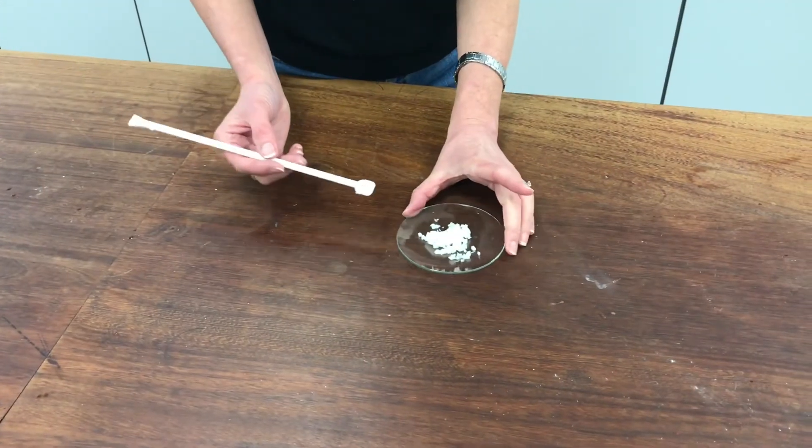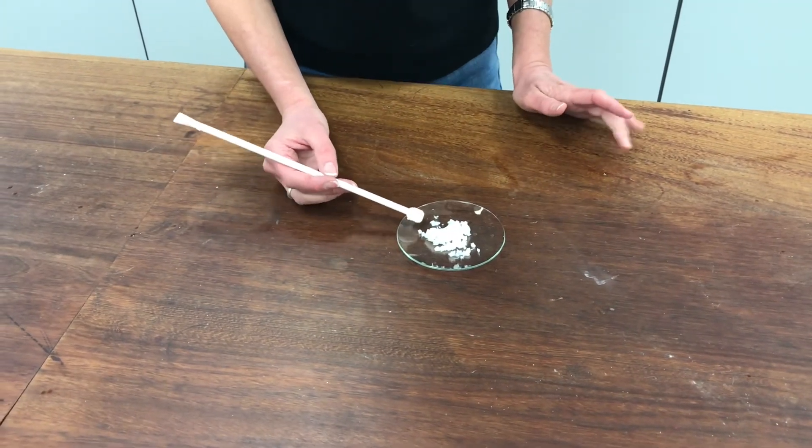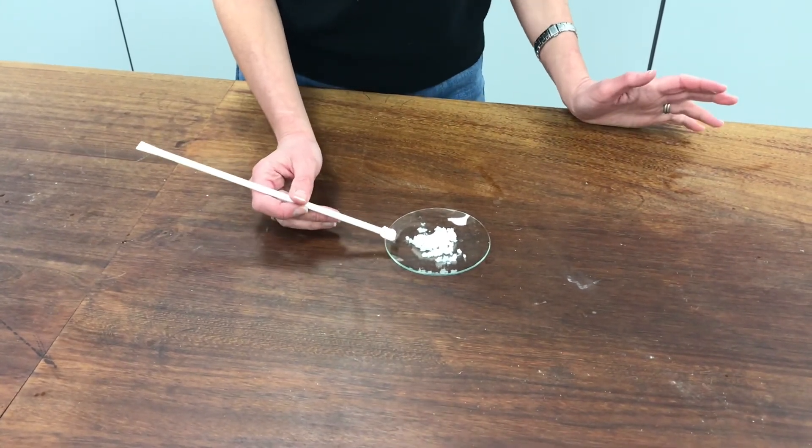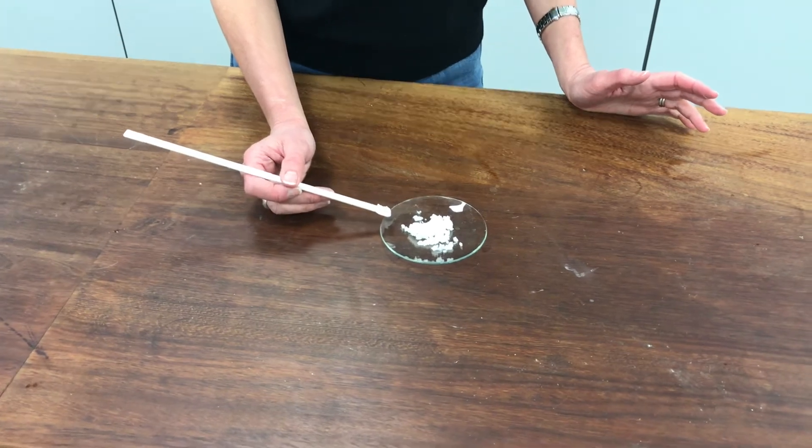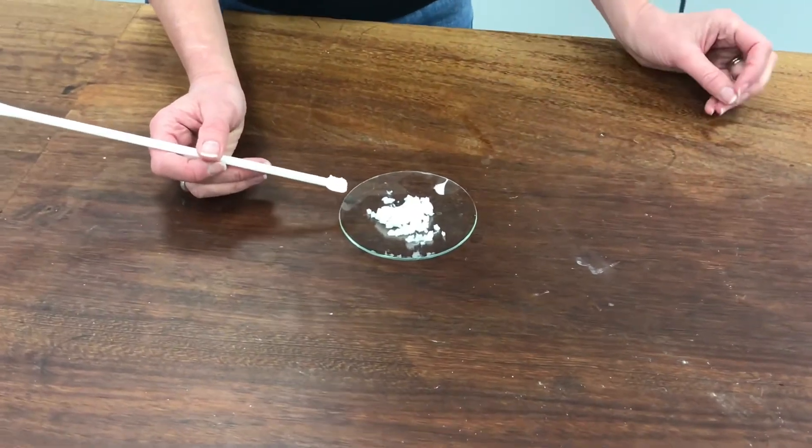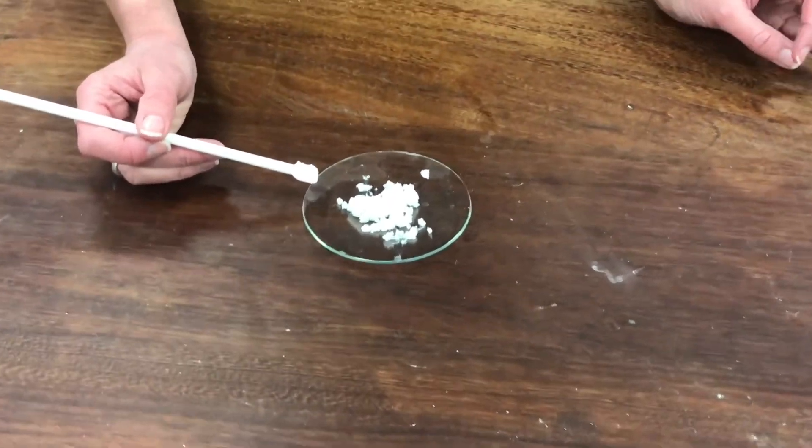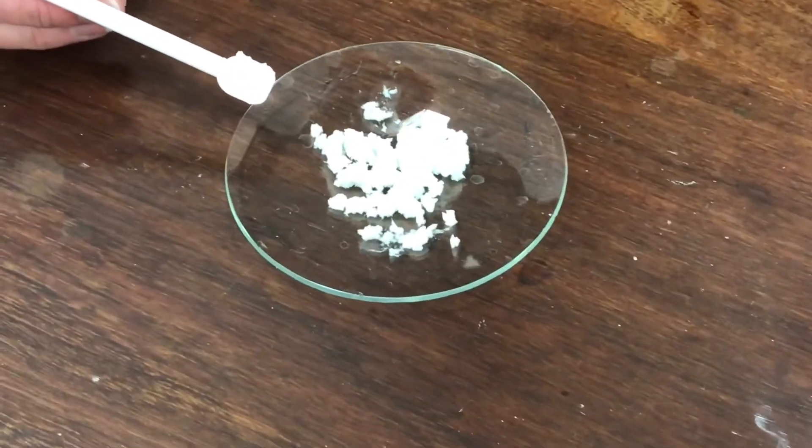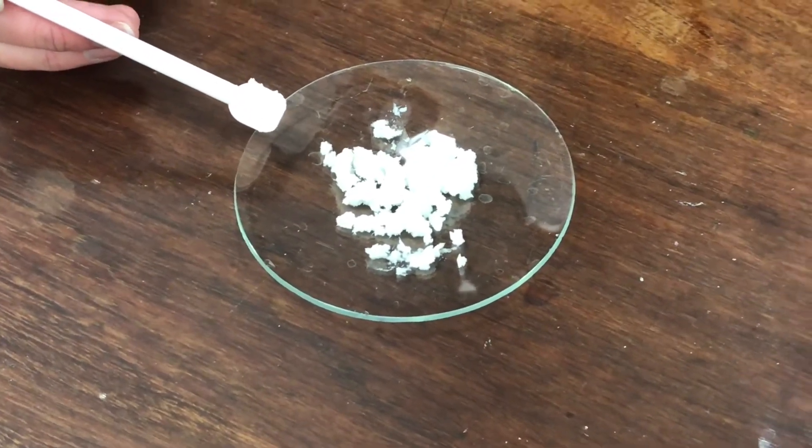So I've transferred my product now onto a watch glass and I should leave that to dry really, to air dry to constant mass. And then I could transfer it to a specimen bottle and calculate my percentage yield if I wanted to. Or probably more likely, as I've spent all this time recrystallizing it, I might like to try to take a sample and test the melting point of it.